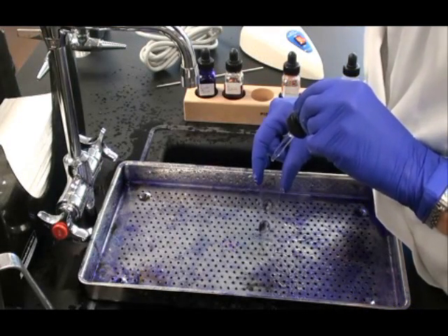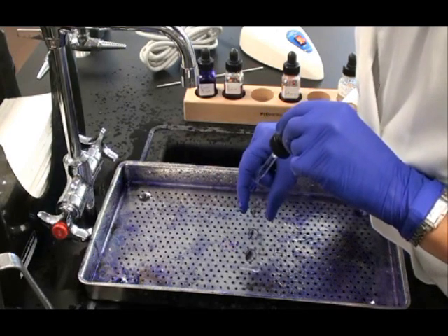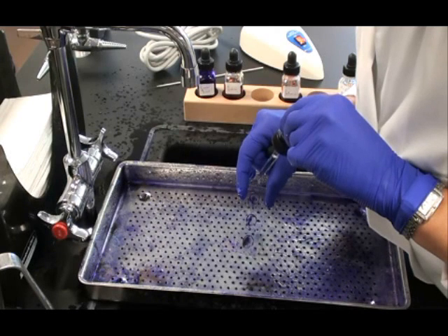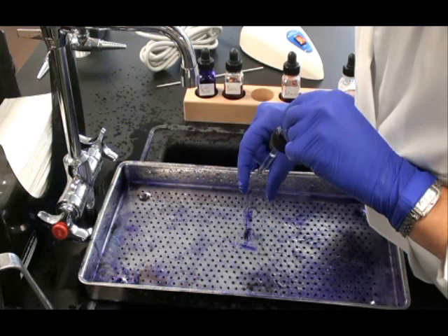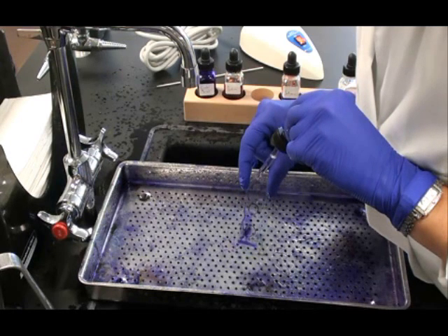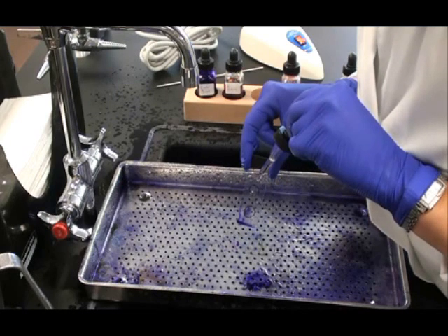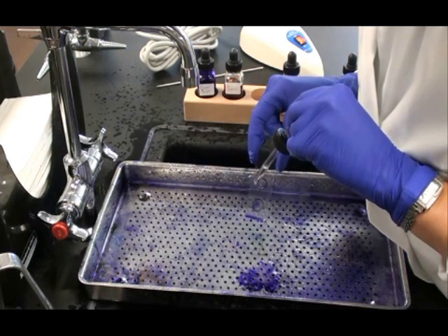I like to hold my slide at an angle vertically and drip that decolorizer down the slide. That way I can see the color being removed from the Gram negative bacterial smear. And then I know things are working right. So I let that drip for 10 to 15 seconds and watch that color leave the Gram negative control.